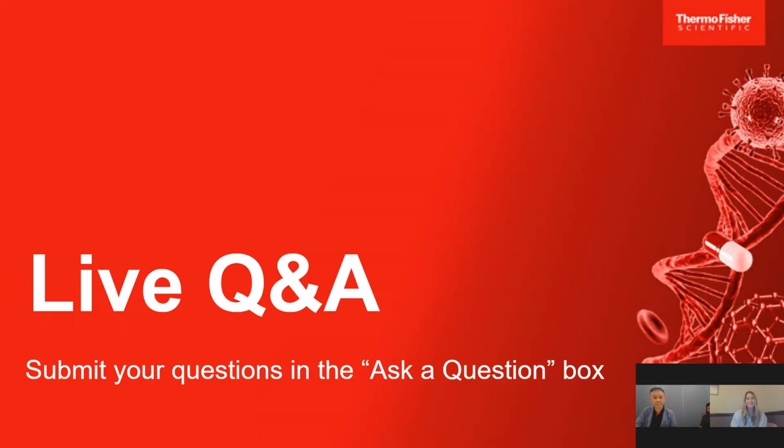Thank you. Audrey, my next question is for you. Why is linear response important for quantitation in Western blotting?